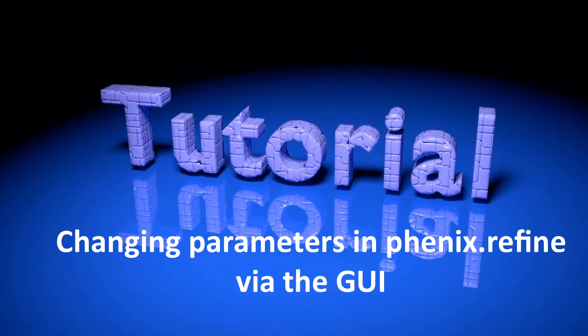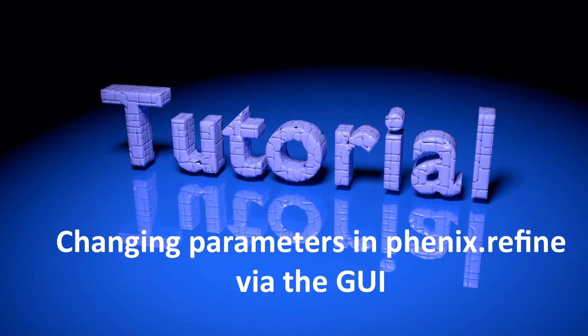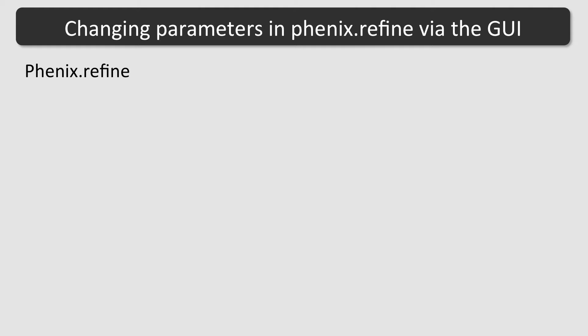Hi everybody! This tutorial is about changing custom parameters in Phoenix Refine. Phoenix Refine has now more than 800 parameters.